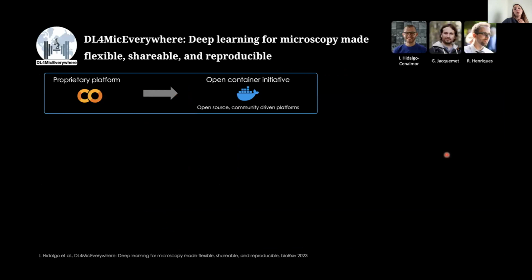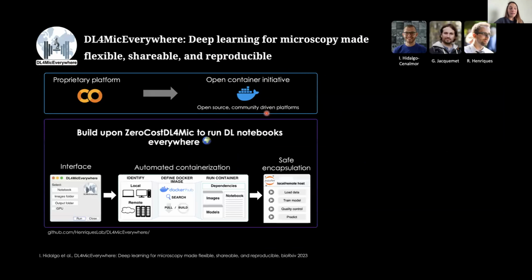And now what we want is to move away from Google Colab and allow using this in local computers or workstations. And this is a new project that we just launched 2 weeks ago, Deep Learning for Microscopy Everywhere. Deep Learning for Microscopy made flexible, shareable, and reproducible. And what we want is to exploit something called containers that is similar to virtual machines that will allow us to basically, once you choose with a very easy to follow interface, the notebook you want to run, where are your images in your local computer.